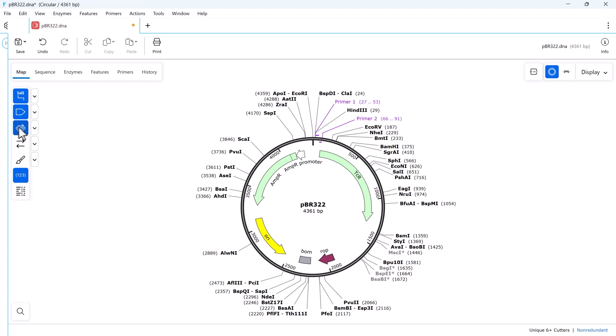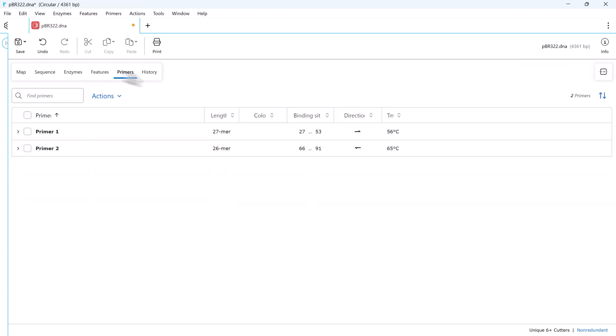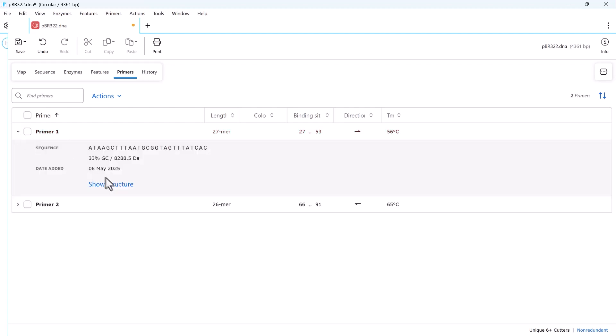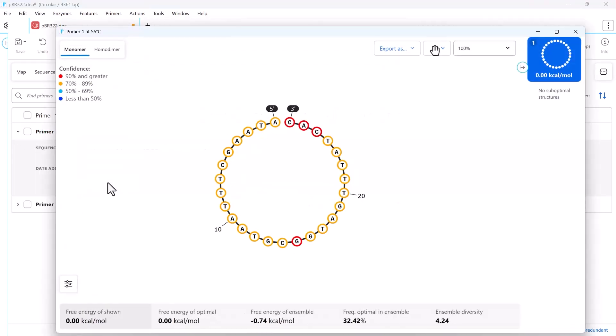Or click on the Primers tab to view, sort, and search the complete list of primers in your sequence. There are options to show or hide primers, and the expanded display allows you to check the structure of your primer.